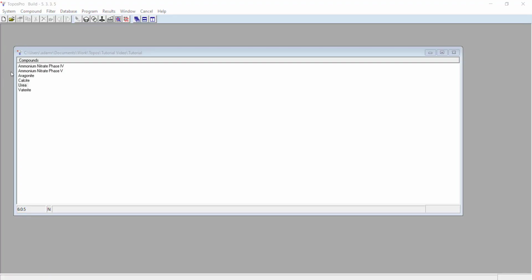So now that we've renamed our CIF files to explain what structures they represent, we can go through the process of calculating the bonding information for them. So when you read in a CIF file to Topos, the bonding information is not stored, so we need to recalculate it for the intramolecular bonds, but we also need to identify the interactions to the neighbors, so intermolecular bonds like hydrogen bonds and van der Waals interactions. CrystalGrower needs these to figure out the neighboring molecules in the crystal.